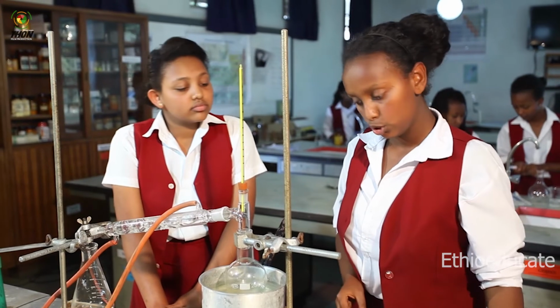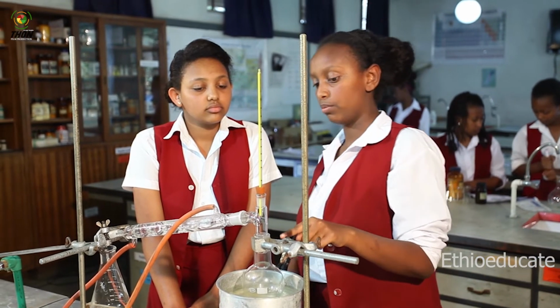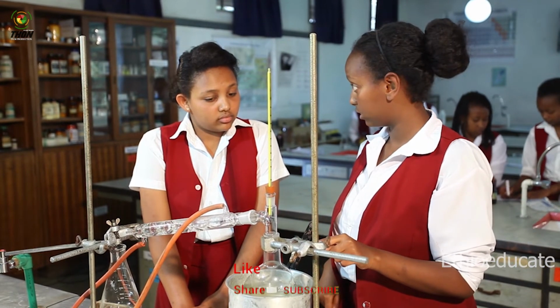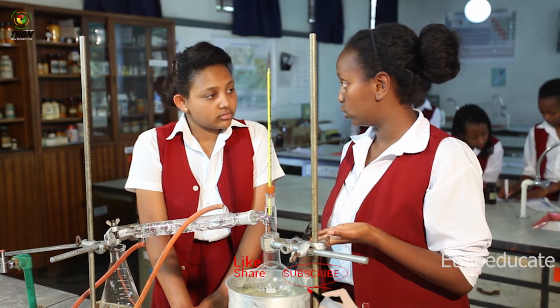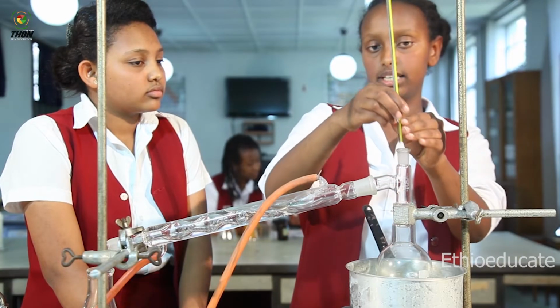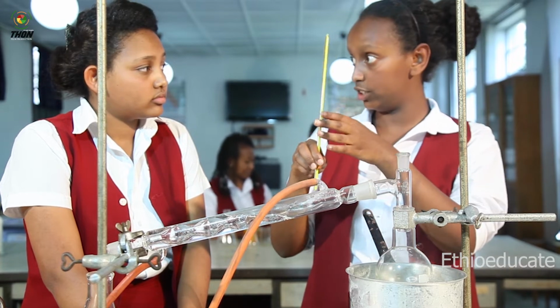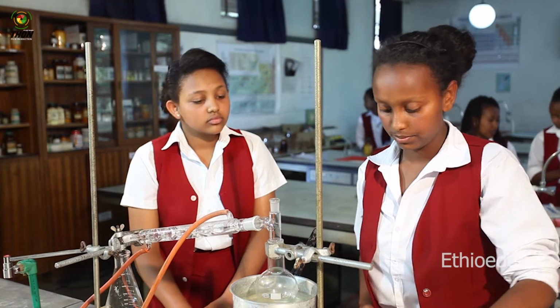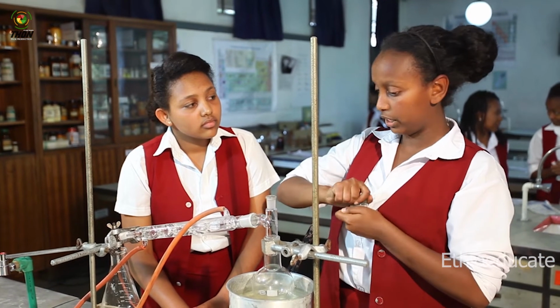Okay. So I'm going to put my mixture into my round bottom flask, but I'm avoiding direct heat contact. So I have here a water bath so that it can heat it indirectly. Now I'm going to take this out. I have a thermometer for later so I can identify their boiling points. And I'm going to put in some boiling chips.